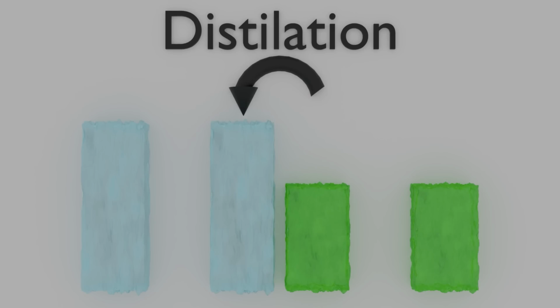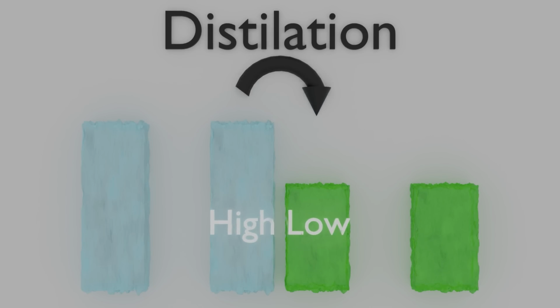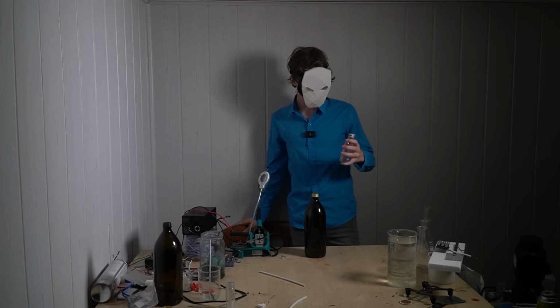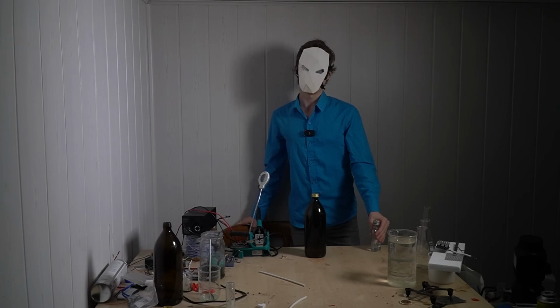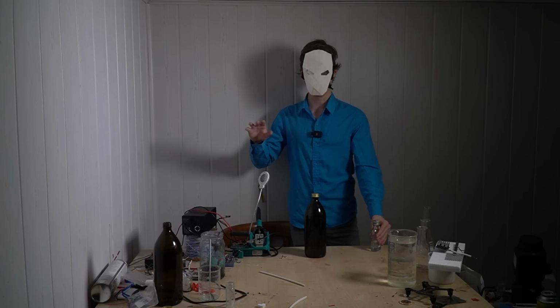This is especially convenient because right now we have a way to divide the product in which this is the difference in their boiling points, and a way to divide the product if this is the difference in their boiling points. Distillation works for both. And so yeah, distillation is actually pretty simple on paper. In practice, it's way more annoying, and I mean way more annoying.